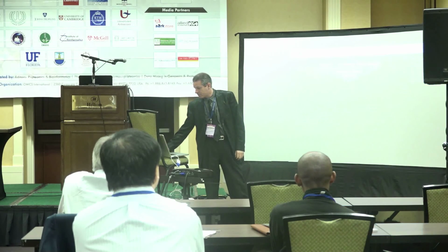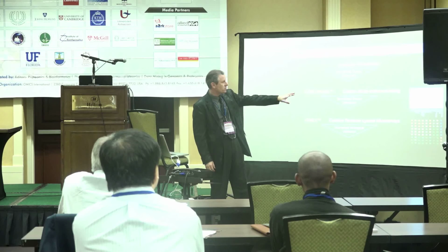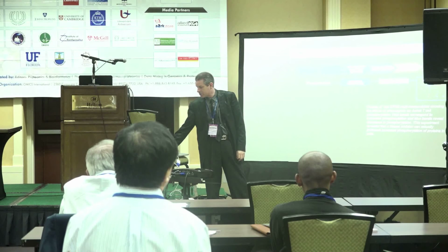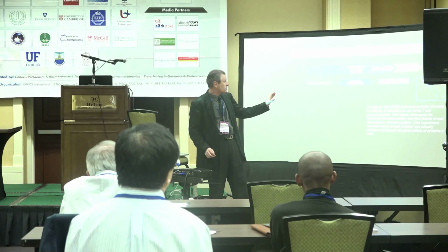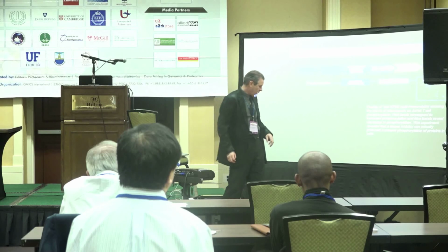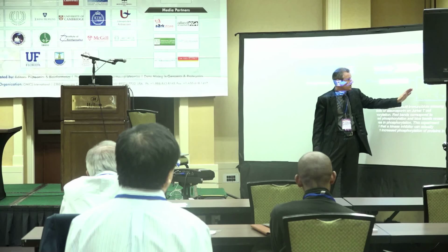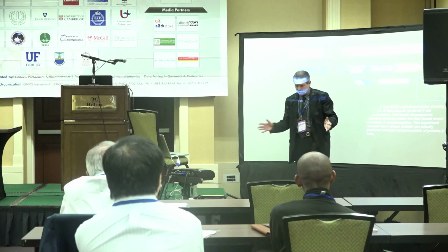these groups. So basically, we see a situation where you go from a microarray, you validate by Western blotting the results from your microarray, and then you go to a lysate microarray to do the validation. And we have multi-blots where we can have panels of about 30 different antibodies utilized. Different panel of antibodies in each lane. We use a multi-blotter to separate the antibodies from each other.